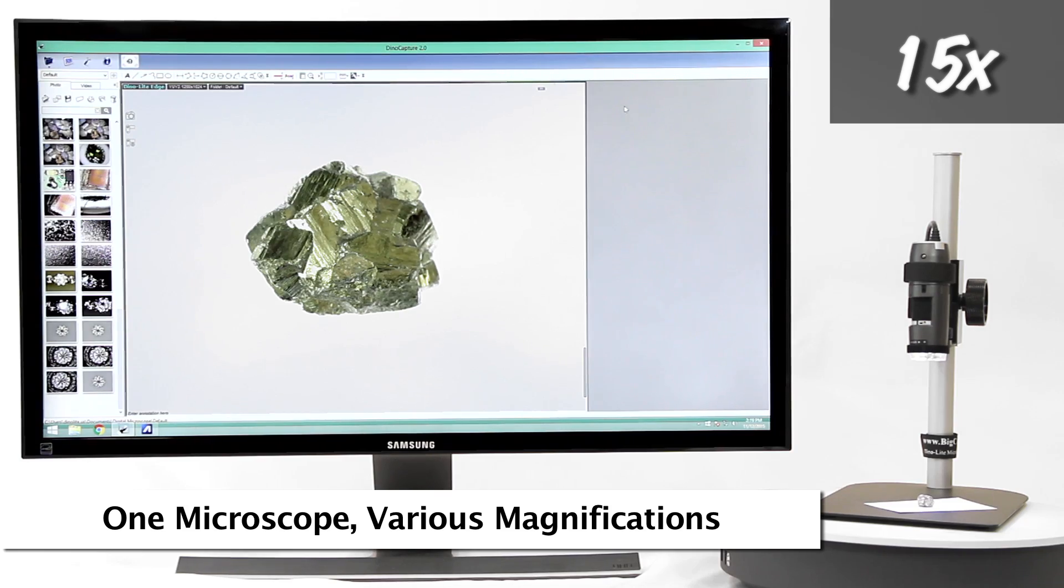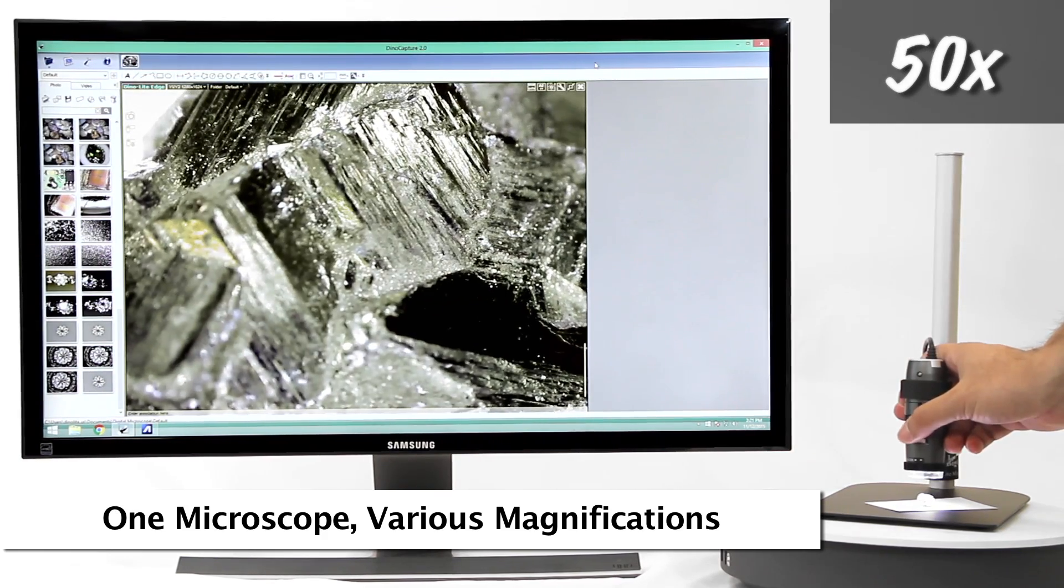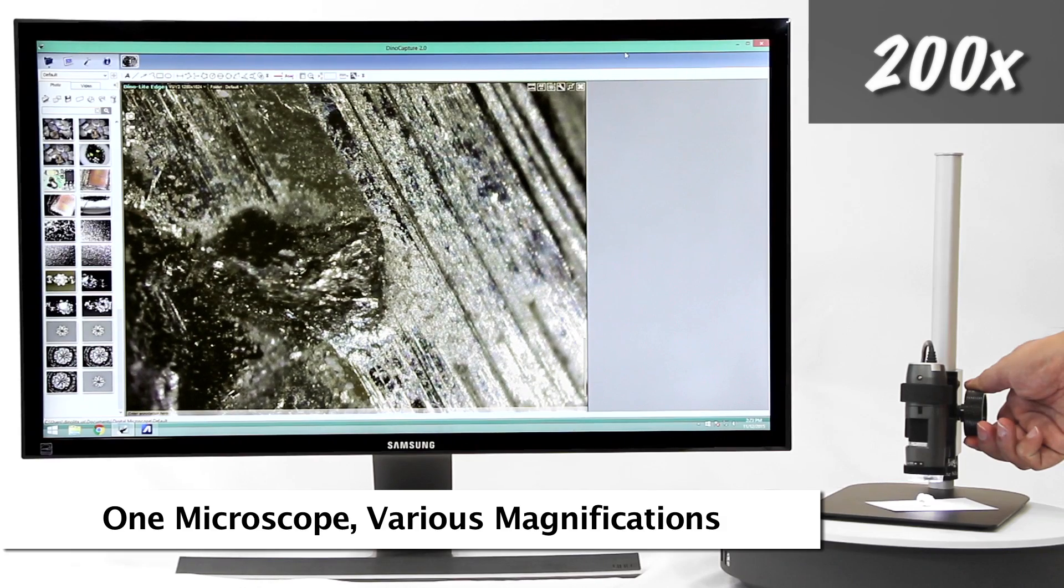The Dynolite can be easily used in a handheld capacity for viewing and inspection, but for the best stability and imaging results using a stand can help greatly.